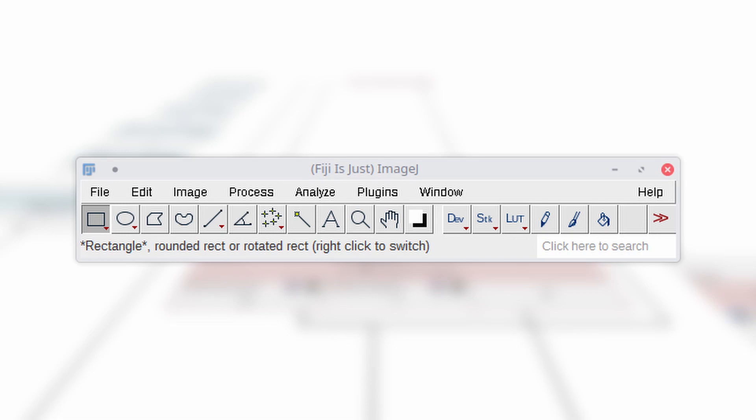As many of you know, ImageJ is a very powerful and user-friendly tool that's applied for image analysis. This can be expanded with hundreds of plugins.